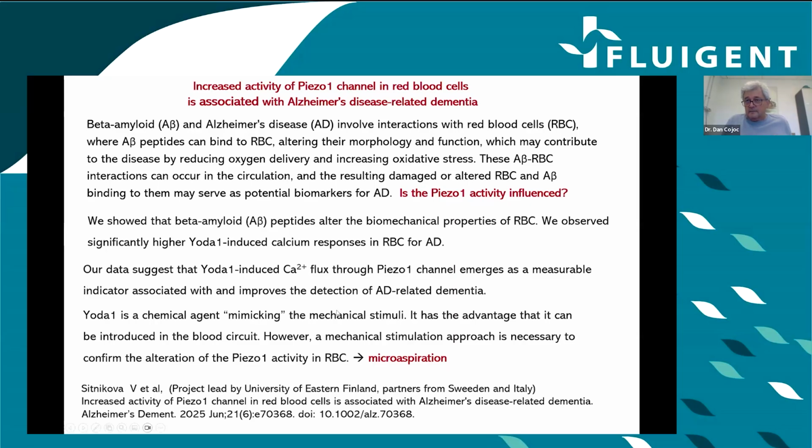But the mechanical effect on the cells is interesting to study, and we did this through microaspiration. And the results are published in a recent paper. They are the result of a project led by the University of Eastern Finland with partners from Sweden and Italy, and it is published in the Alzheimer's and Dementia journal.